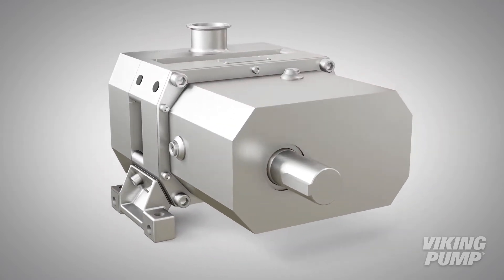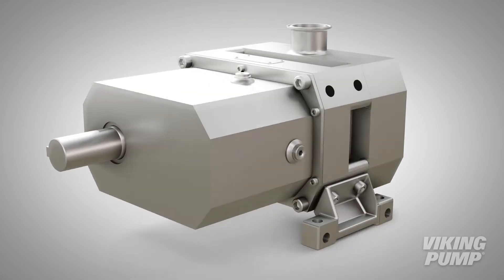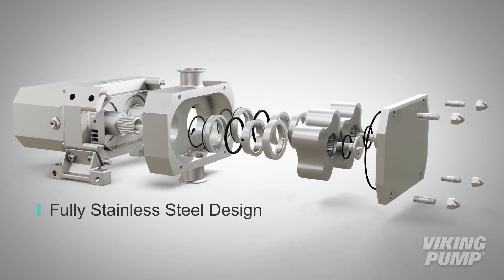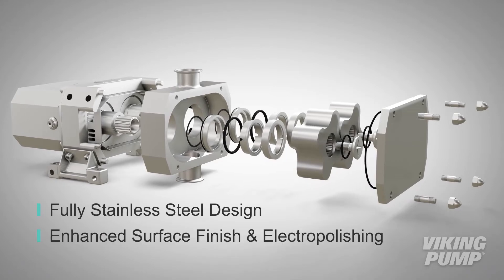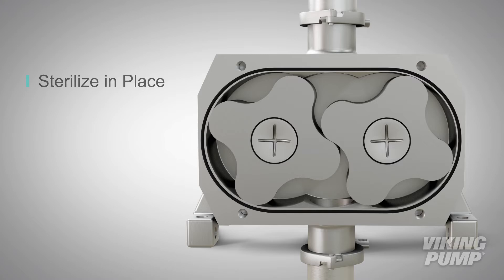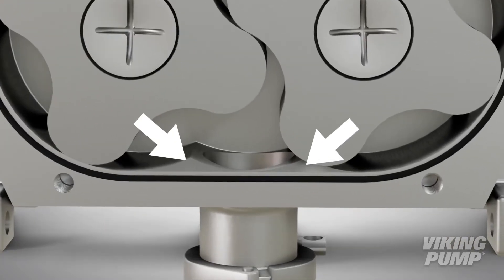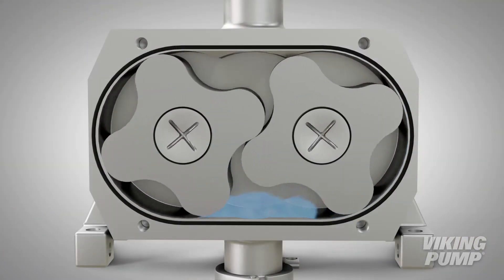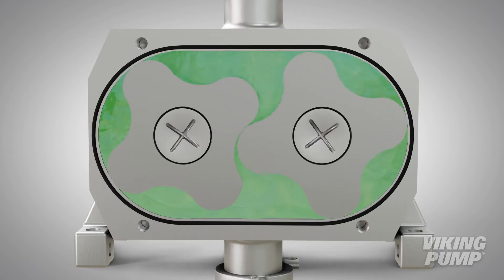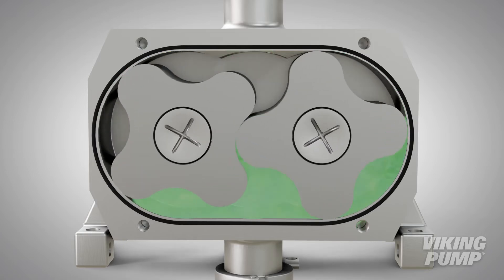Keeping process equipment clean requires regular clean-in-place or sterilize-in-place processes, and the Sterilob Series is designed to be integrated with these methodologies. A fully stainless steel design with options for enhanced surface finish and electropolishing to all media contact surfaces allows for complete sterilization without removal from the process. Vertical porting and relieved cusp features in the casing allow the pump to completely self-drain the process liquid prior to cleaning and for the complete draining of cleaning solutions after cleaning is complete.